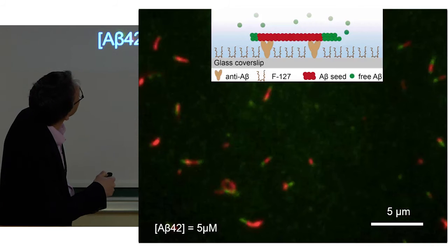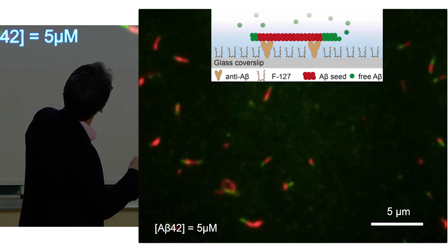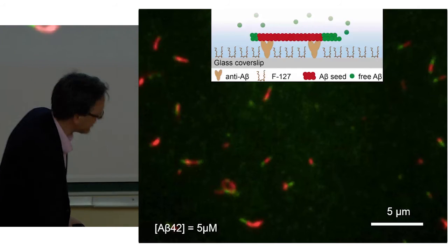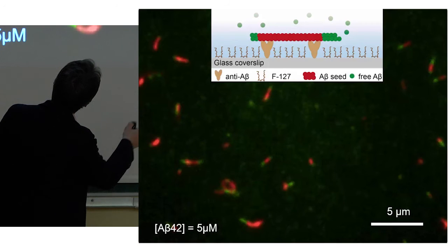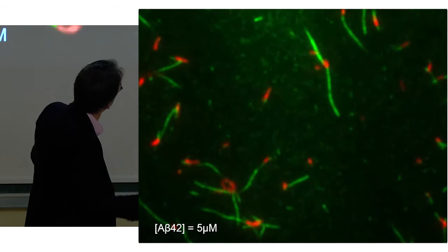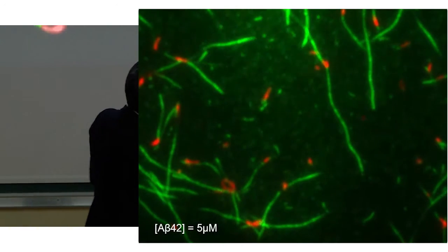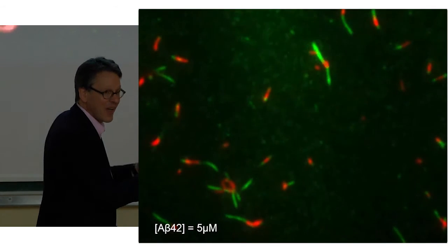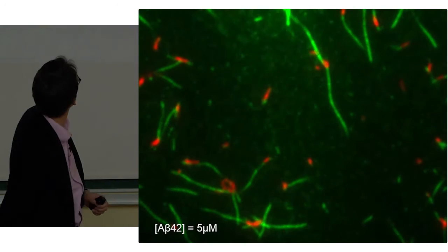So here again, we have these amyloids, and one interesting question in these amyloids is if you have a certain fibril, does it cause other proteins to misfold and grow these fibrils? And you can see this here. In red, we have fibrils of amyloid beta, and in green, we have a monomeric solution of protein that's healthy. But the presence of this fibril forces this healthy protein to adopt the wrong shape and then grow these amyloid fibrils in time. And this you see here.